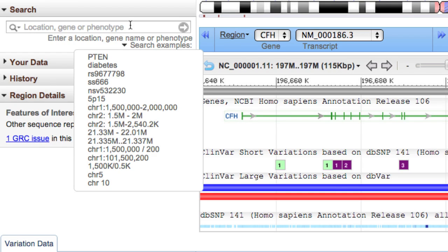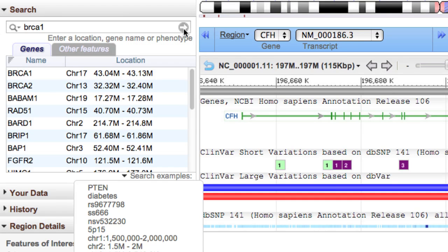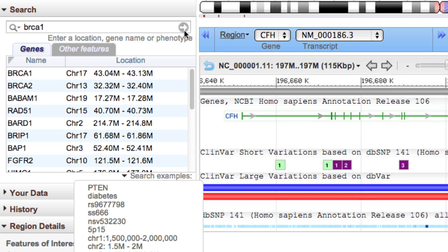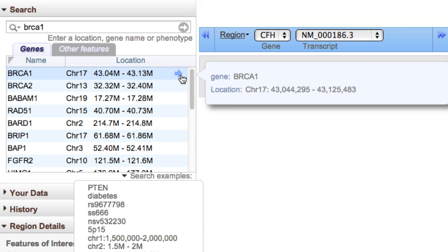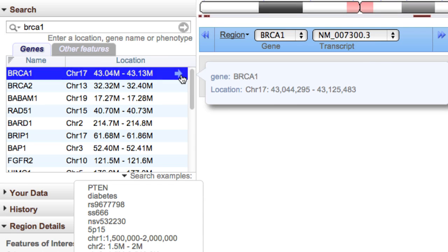I'll search with the breast cancer gene symbol BRCA1. Results are shown in two tabs: genes and other features. To update the other components, mouse over the desired gene result and click on the arrow to the right.